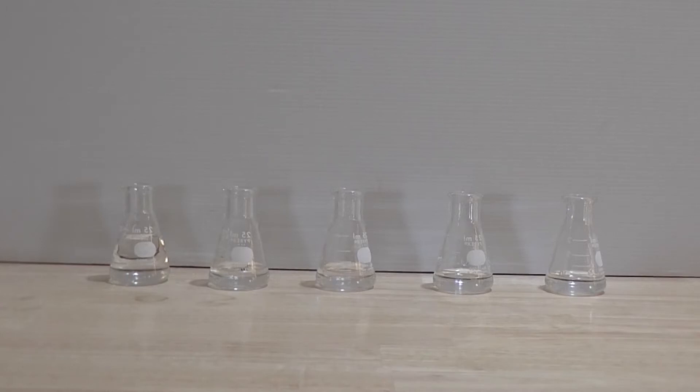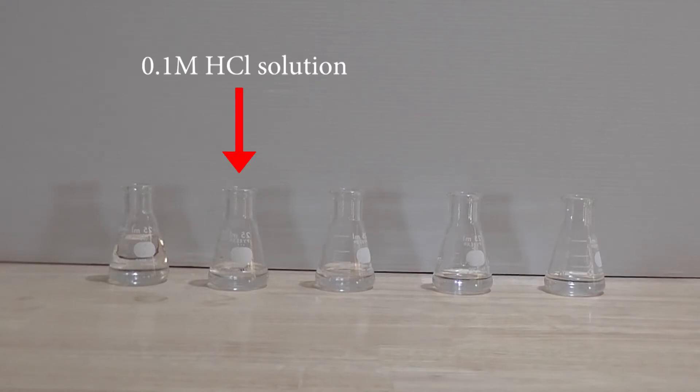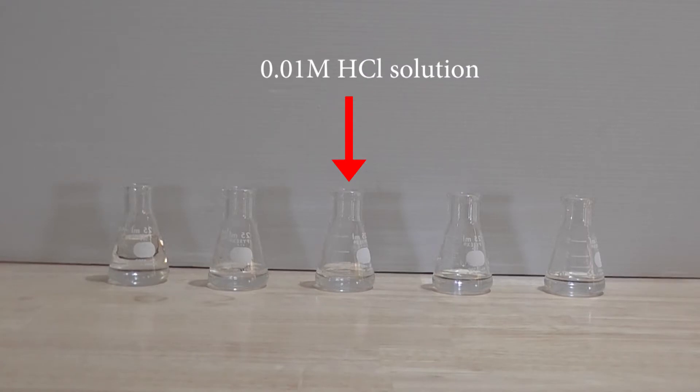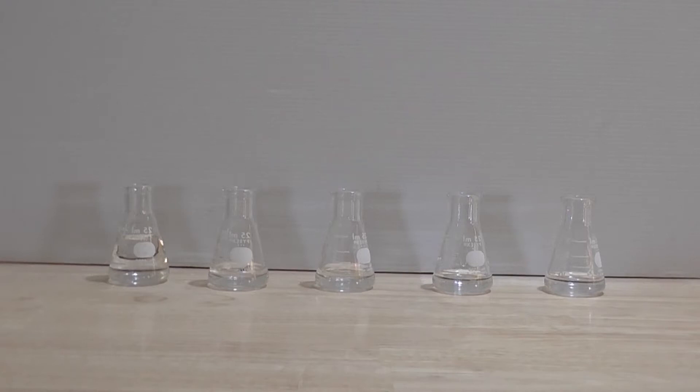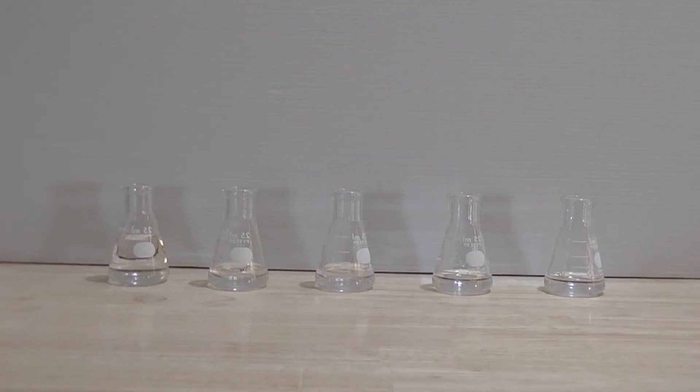Starting from left to right, the concentrations of the hydrochloric acids I will be making decrease by a factor of 10 each time. I start with a stock solution of hydrochloric acid with a molarity of 1. The concentration of the second acid will be 0.1 molar, the third will be 0.01 molar, and the fourth will be 0.001 molar. The respective pHs starting from left to right will be 0, 1, 2, 3, and 4.